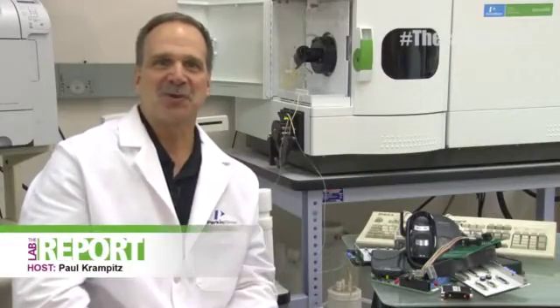Welcome to The Lab Report. I'm your host Paul Krampitz and today we're going to look at the European Union's regulation for waste electrical and electronic equipment.